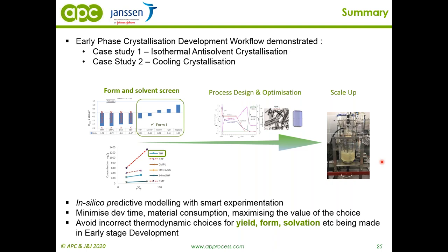Yes. What we found very useful is not only small scale crystallization experiments, but also that very often we perform, for example, competitive slurry trials, and also map out the thermodynamic phase diagrams. But what I also found very useful in Crystalline especially is to map out the kinetic phase diagrams. These are experiments where we usually seed a mix of the forms, and then we just want to see what form will crystallize. So we do not wait for the thermodynamic equilibrium, but just see what will crystallize after the seeding, after 3 hours. This is what I found very useful.